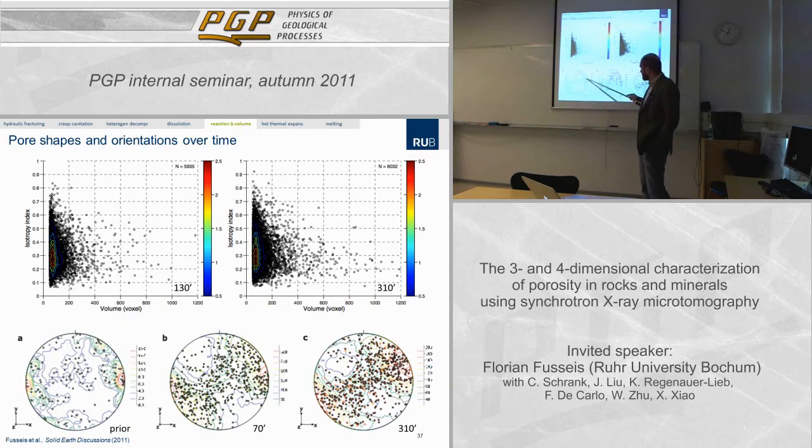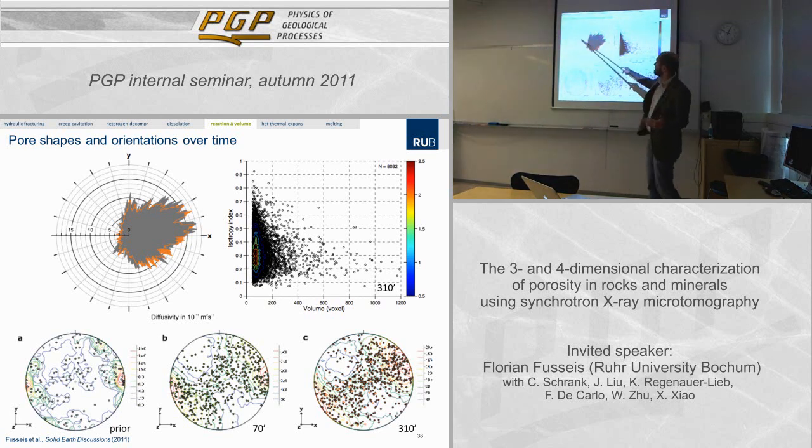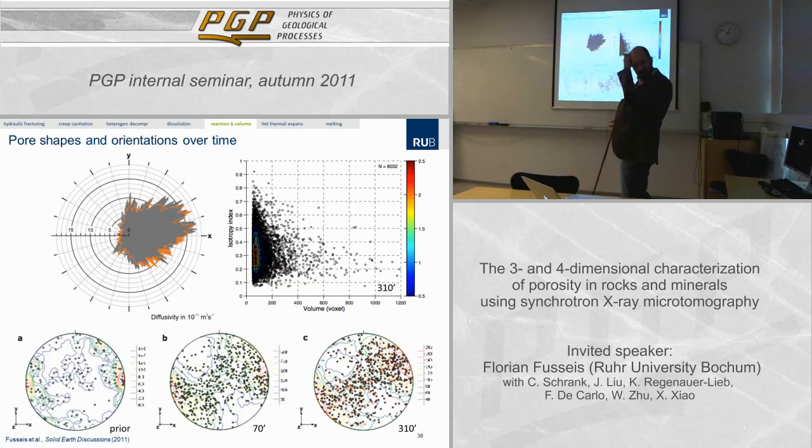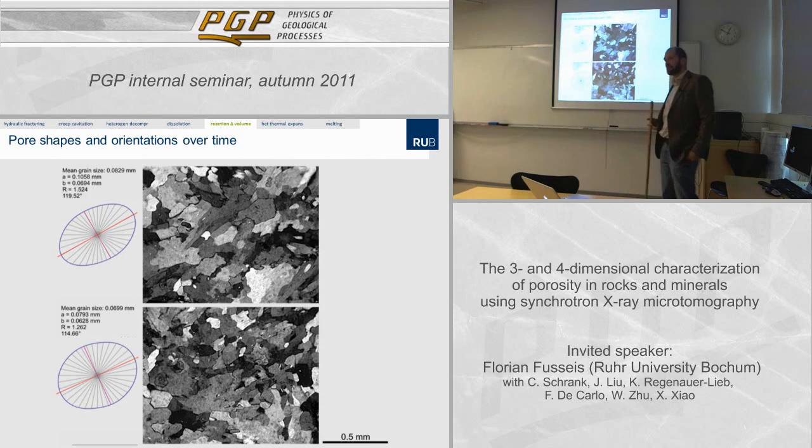Interesting for us was to observe that there's a similar pattern already recognizable, albeit with many fewer pores, but the same great circle is already present. And that fitted together very nicely with this observation, which shows the diffusivity that we have determined for the advance of the dehydration front as a function of orientation. Again, this is the same orientation, so the vertical axis is coming out perpendicular from the projection plane here, and we can see that the front is indeed propagating fastest in this direction. That resembles something that we could not observe directly, but we did quantify shape anisotropies in Volterra alabaster.